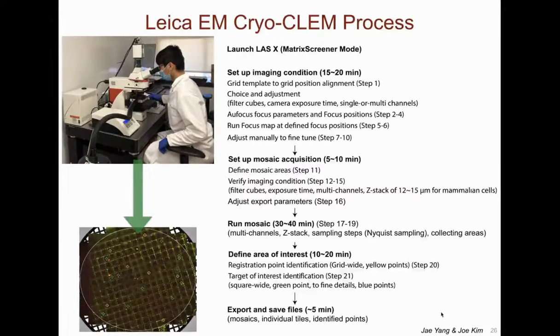So, once you have prepared your specimens and loaded them into the Cryo-CLEM transfer shuttle, you are ready to begin CLEM imaging. As you see here, Joe is ready at the microscope. Notice that he is in appropriate PPE and he's wearing a face mask, not only because we are in COVID-19 times, but because any humidity from our breath that lands on the EM grid can cause devitrification or ice contamination.